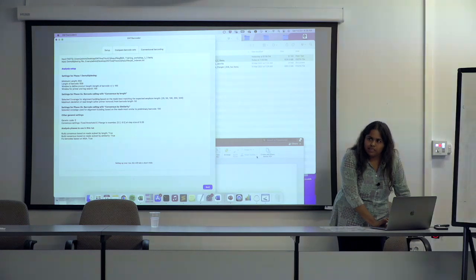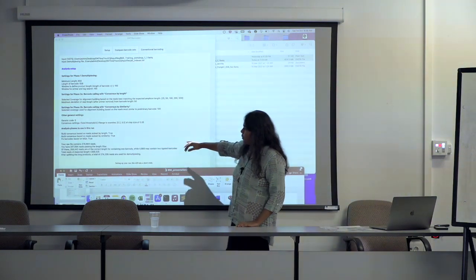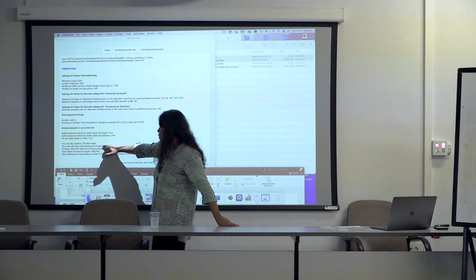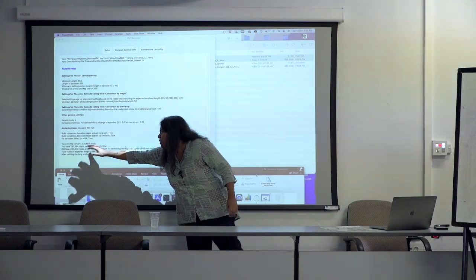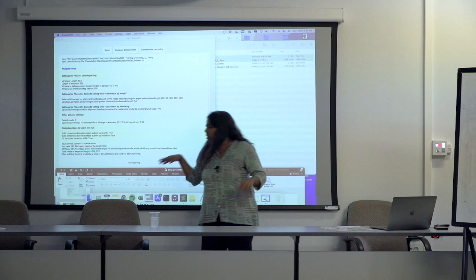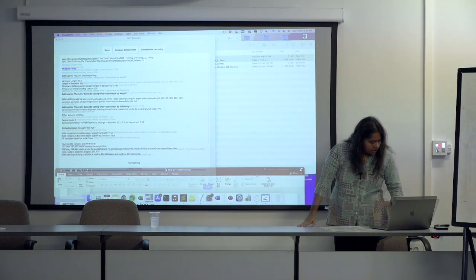It's demultiplexing right now? Okay, cool. So the software, when it's running, will actually start printing out what it's doing. It's describing the splitting and the numbers that you're getting. So you have these raw reads, how many are in the correct range, how many are split, etc.